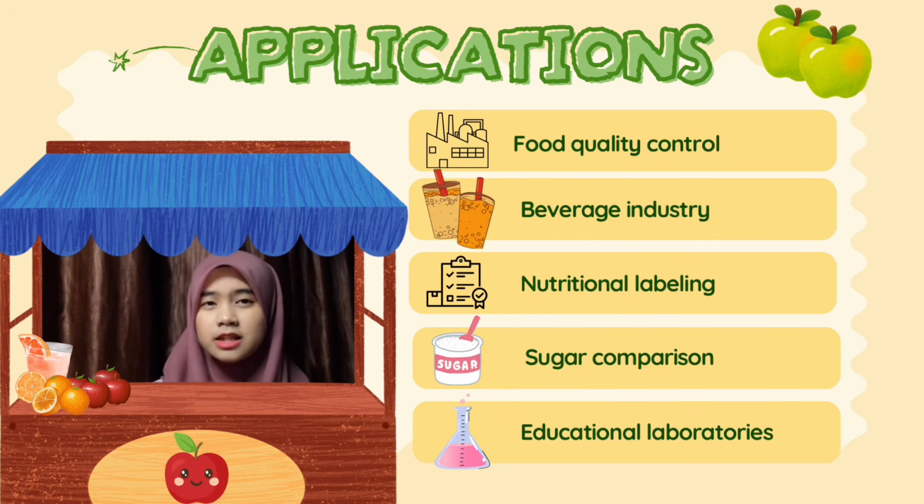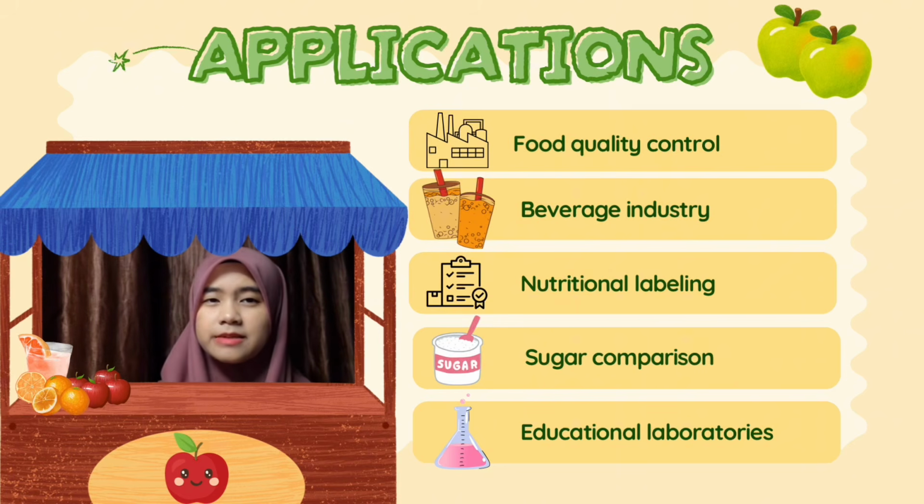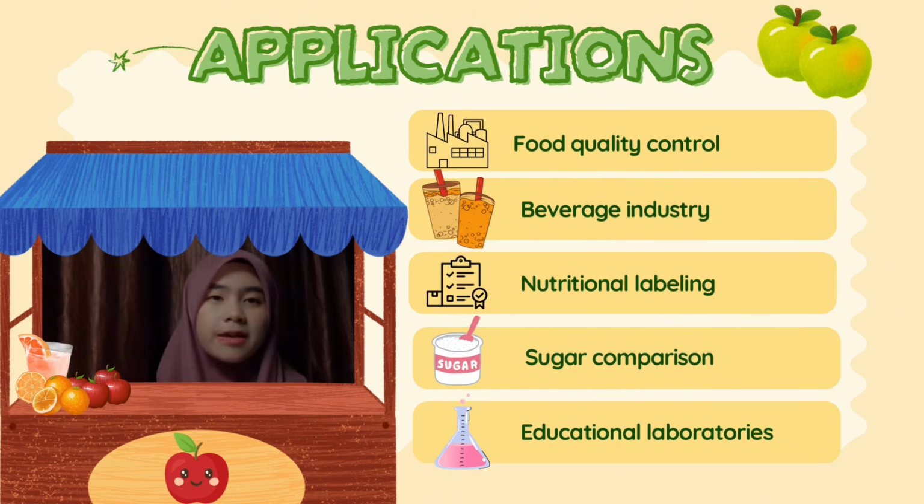And lastly, although industries often use more advanced techniques for detailed analysis, paper chromatography remains an excellent method for learning and understanding the basic principles of analytical chemistry.